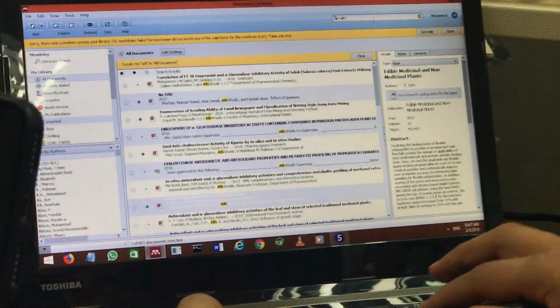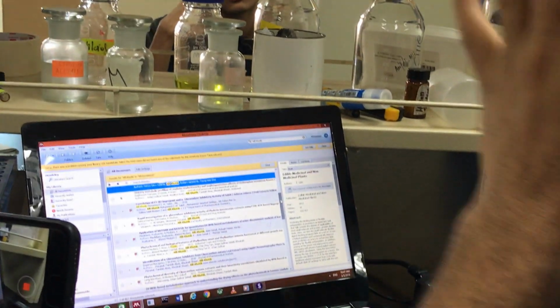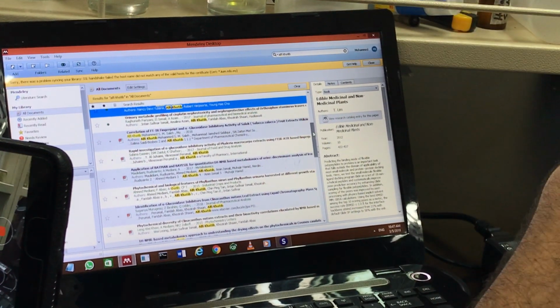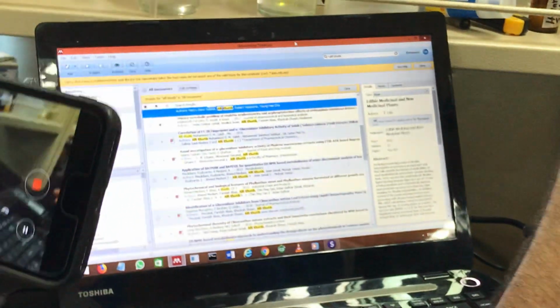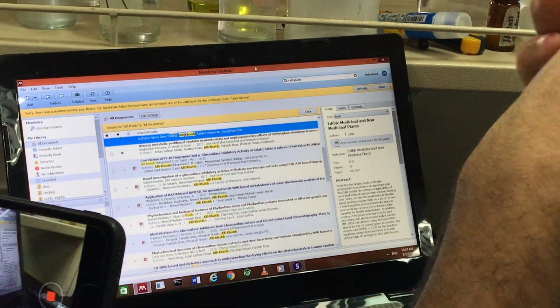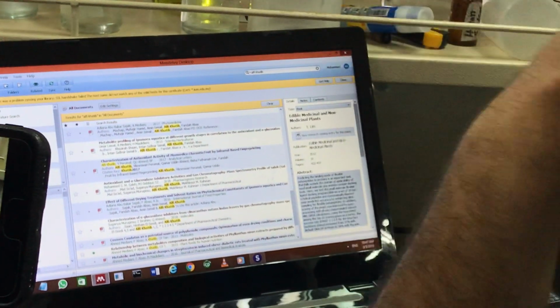Yeah. So theoretically, 100% water or 100% ethanol should be less active. It doesn't matter what the extract is, it should not be non-active, because different plants have different metabolites. You cannot say it should be 100% not active for water or 100% ethanol. It depends on the plant; there's no standard.